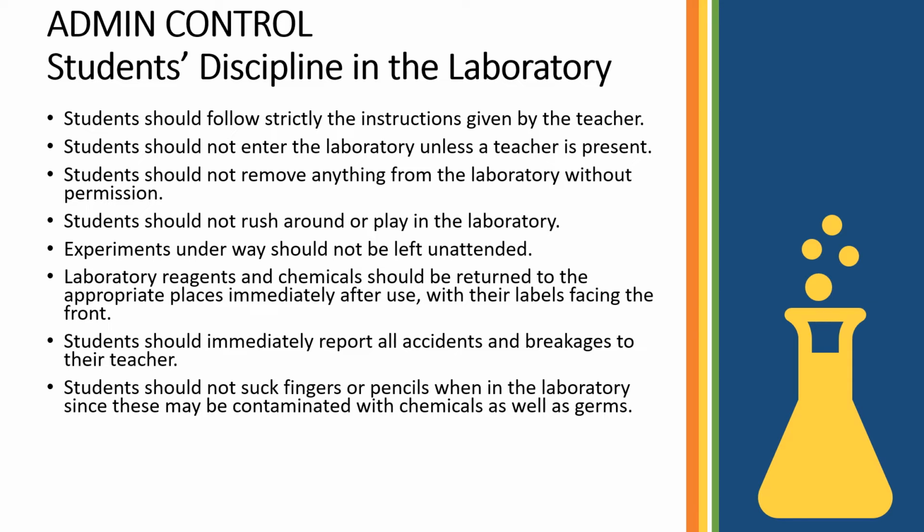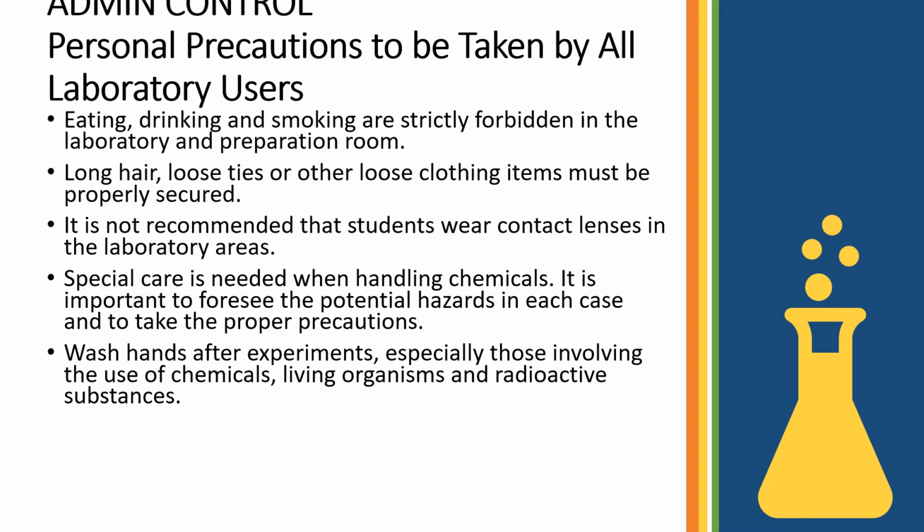Laboratory reagents and chemicals should be returned to the appropriate places immediately after use with their labels facing the front. Students should immediately report all accidents and breakage to their teachers. Students should not suck fingers or pencils when in the laboratory since they may be contaminated with chemicals as well as germs. Personal precautions to be taken by all laboratory users.